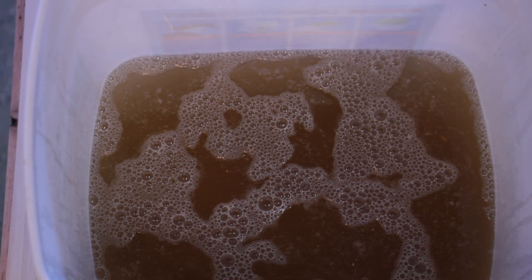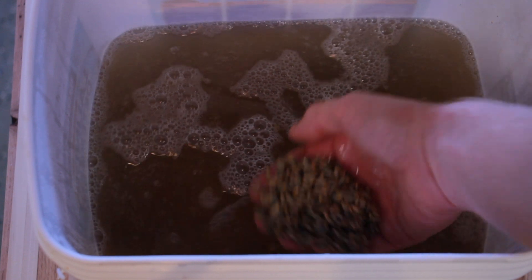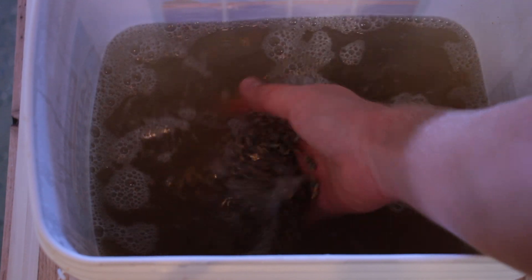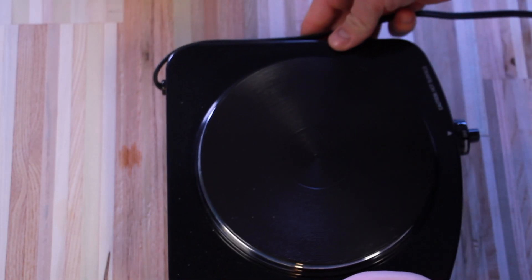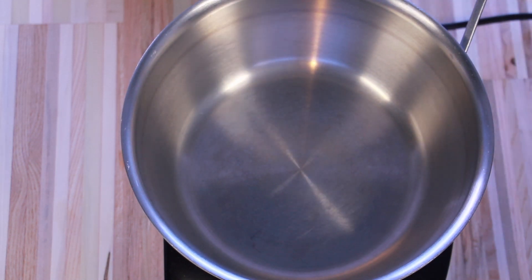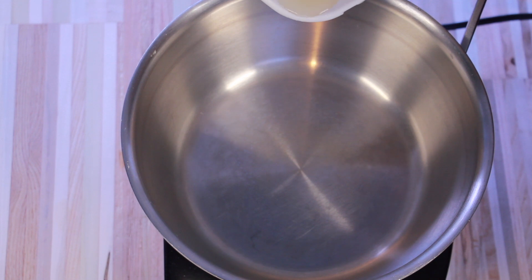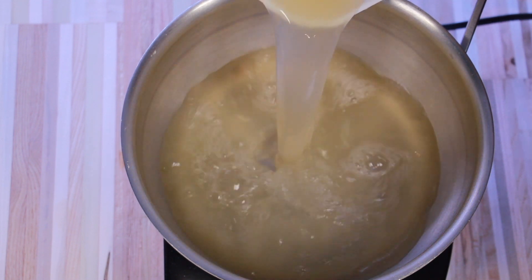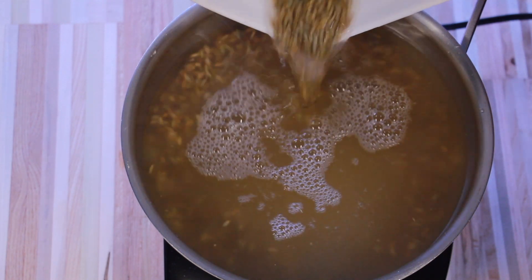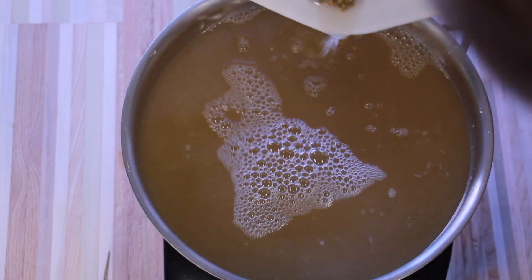Now, the first thing you'll notice when you take the lid off is it's going to smell bad. Any bacteria, yeast, or spores that were in your rye grain had a chance to germinate overnight and the smell is not very pleasant, so just be aware of that. If you live with other people, I don't recommend boiling your rye grain in the house because it will make your entire house smell bad. So if you have a way to do it outside or in the garage, I recommend that. If not, just open your windows and start a fan in the house.